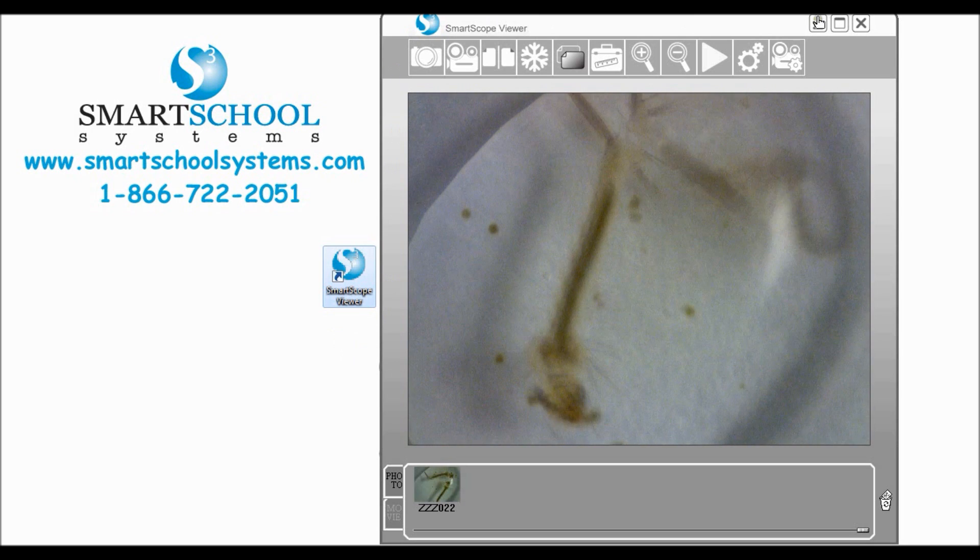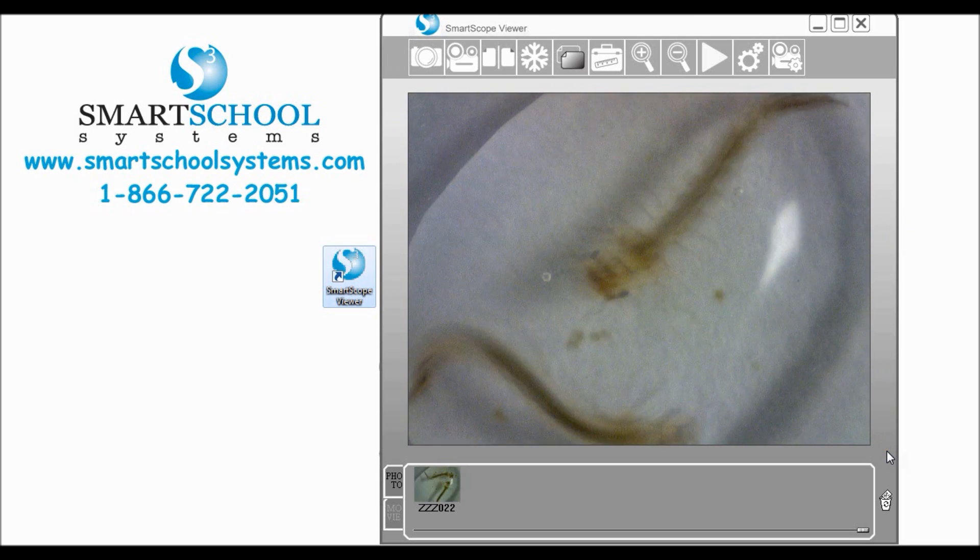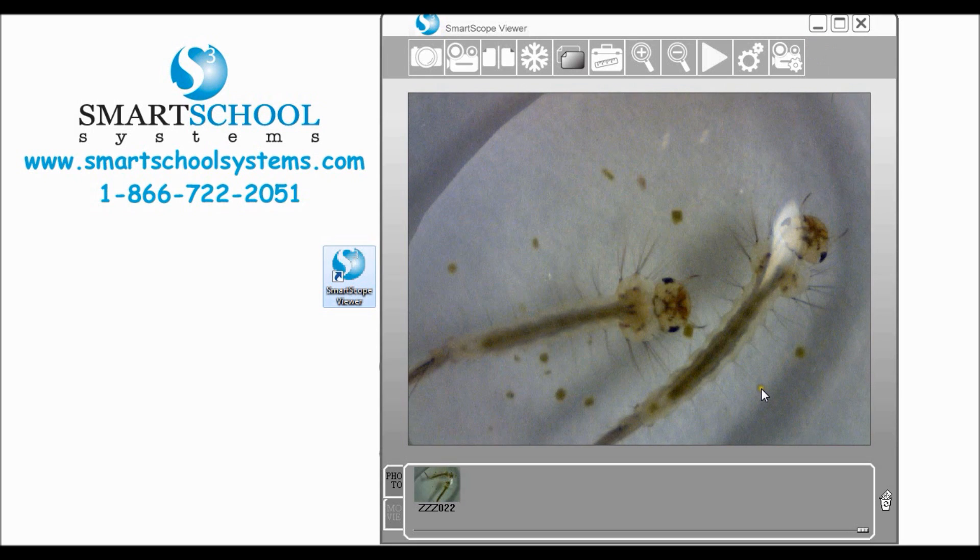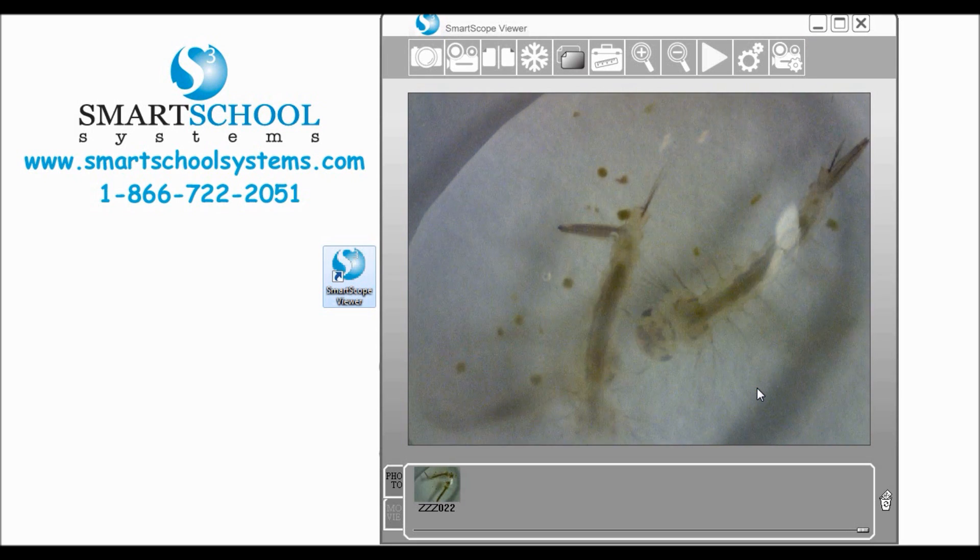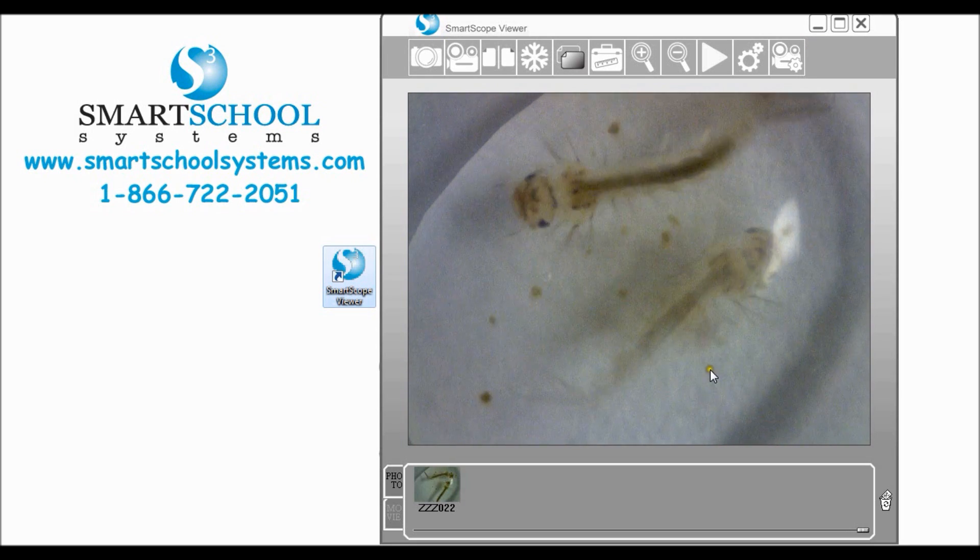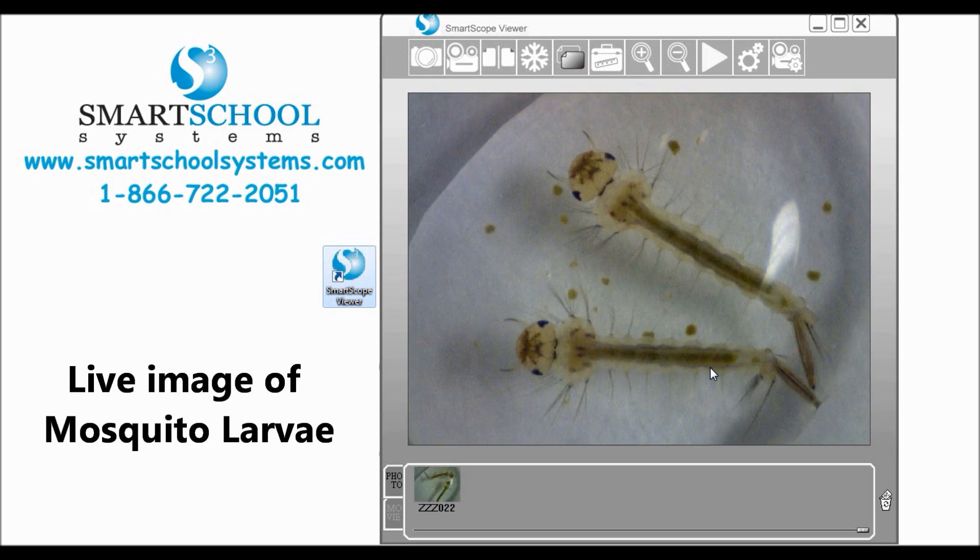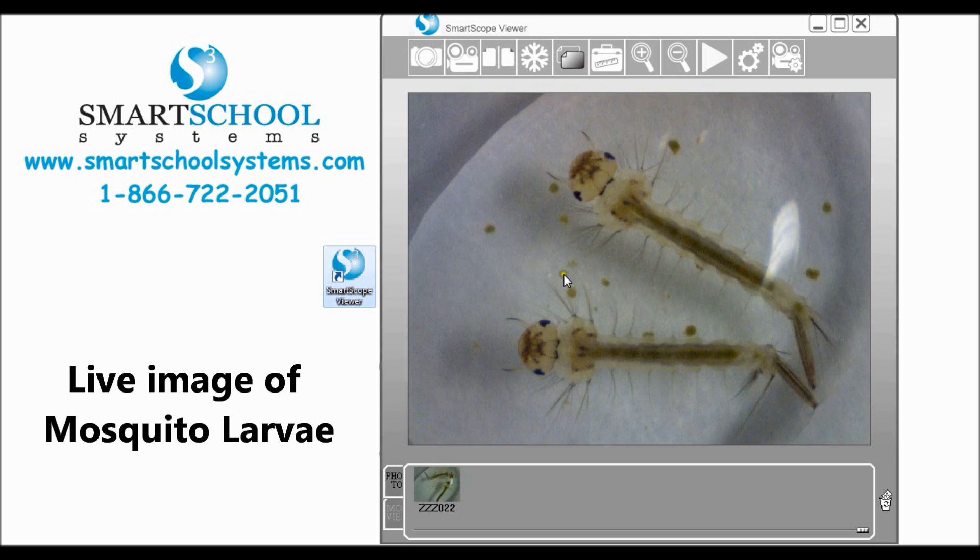Your software will open up and you'll see a window that looks like this. You'll have a toolbar across the top and the live image from your SmartScope. What we have here, I'm viewing a couple of mosquito larvae.